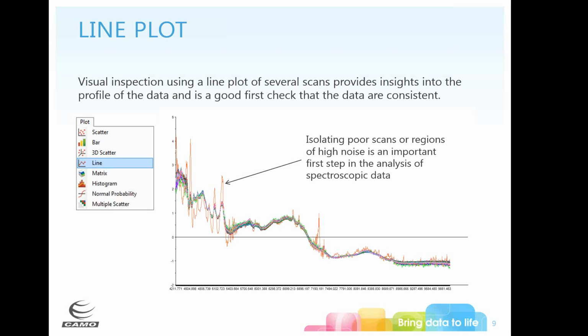If we plot it like this, we can instantaneously recognize that, mark that sample, and remove it from your analysis so that the error doesn't get conflated into your analysis. And you can also see, if you look a little closely, this is pretty noisy data, especially for NIR. You don't see that very often, which gives me some indication of what types of pre-processing I might want to do. In this case, I definitely want to do some sort of smoothing to get rid of those little bumpy noises, because that's just noise and it's going to detract from the information that we really care about.